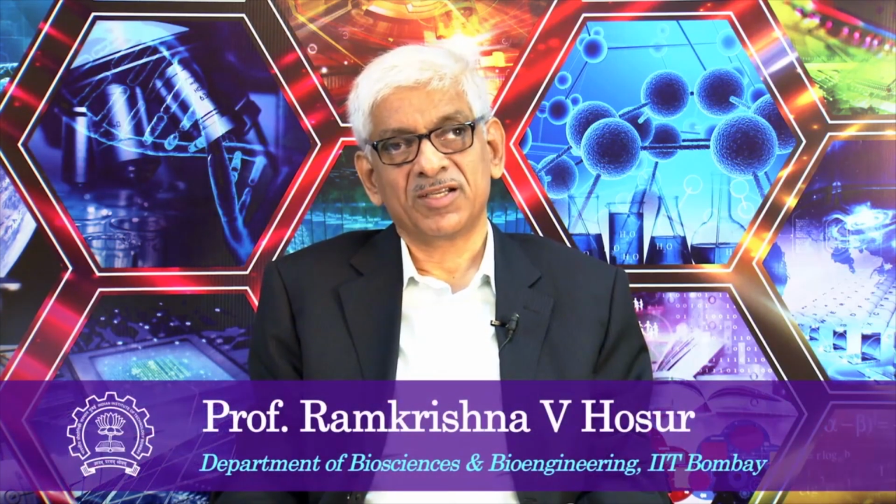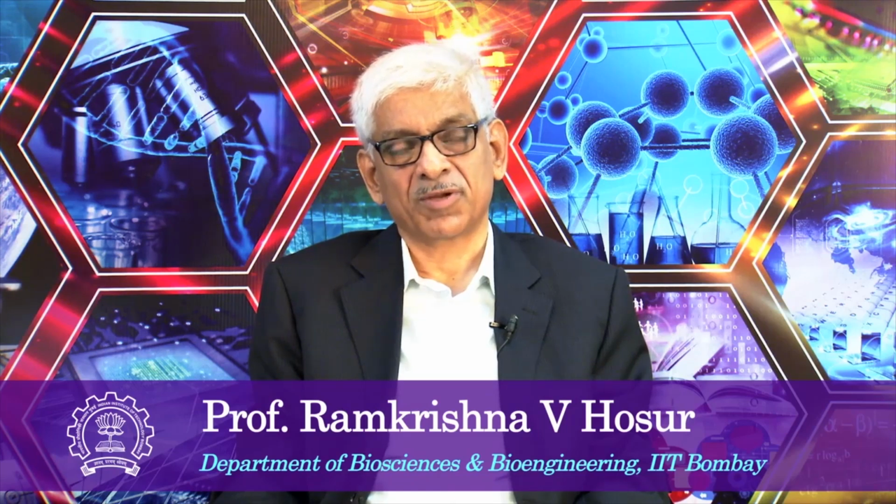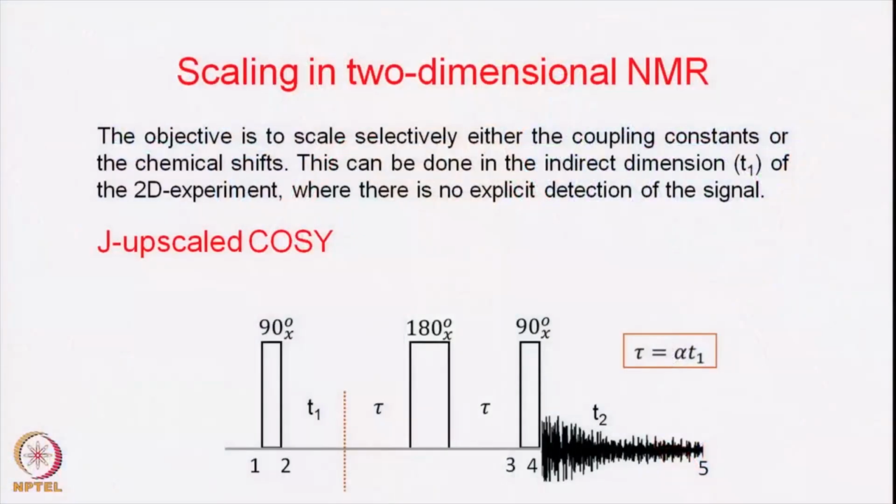We are now going to discuss a new concept in two-dimensional NMR. So far we discussed different types of 2D experiments, 2D separation of interactions, namely the chemical shifts and the coupling constants along the two dimensions of the 2D NMR spectra. We discussed correlation experiments where spins which are coupled in one way or the other can be understood by looking at the correlations in the two-dimensional spectra. The cross peaks in the 2D correlation spectra reflect the correlations or the interactions between the spins.